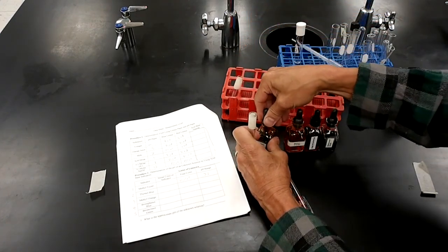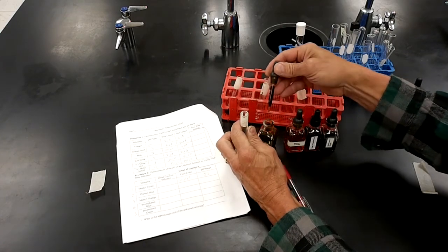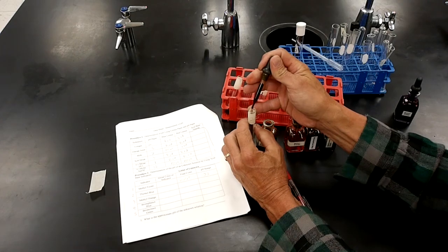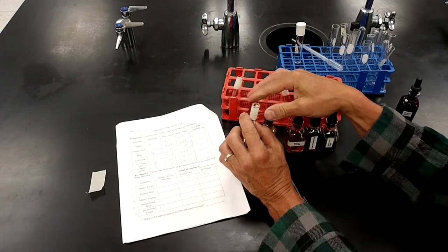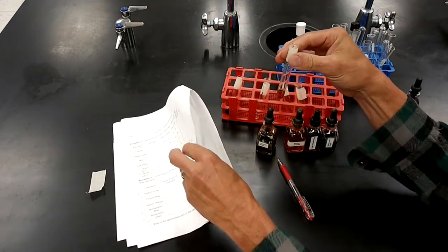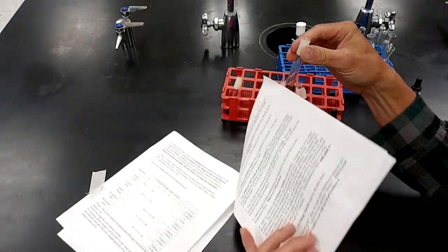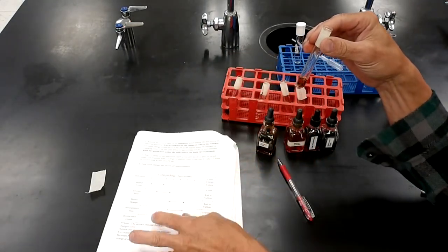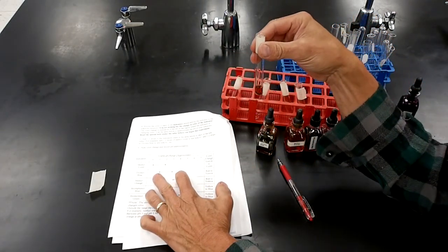We'll put in thymol blue. It's kind of a brownish color to start. 1, 2 drops of thymol blue. We'll look here at the color standard. Red to yellow.